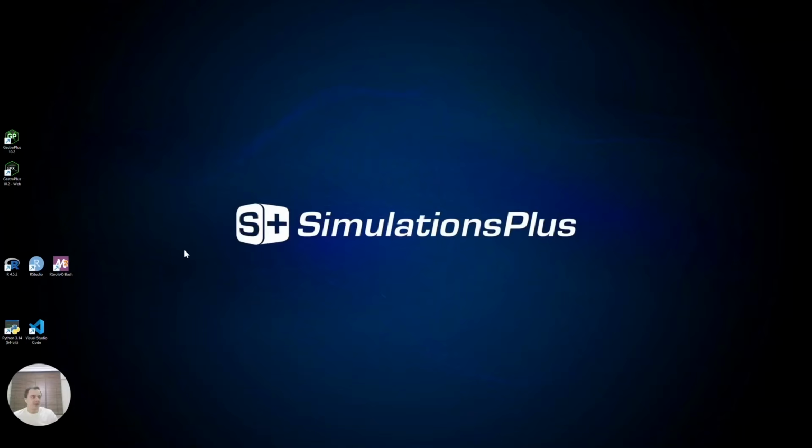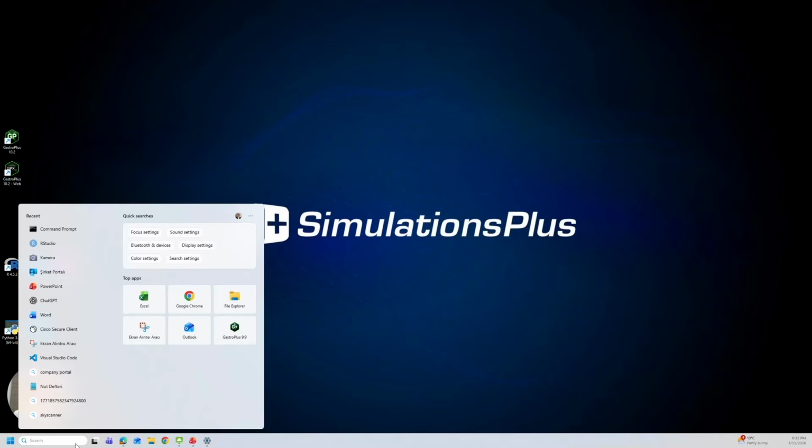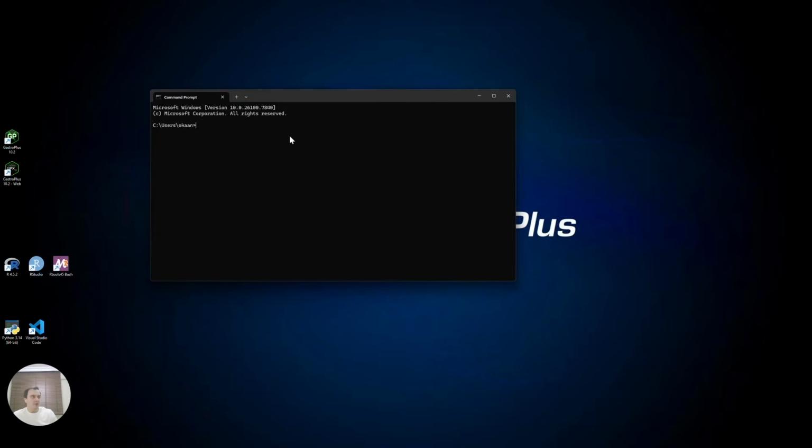Alright, here I am back to my desktop. Here you can see that I have already installed the Python base version and the IDE, which is Visual Studio Code. So we will start with installing the GastroPlus API Python package. So I will go to the Windows search box and type cmd and hit enter. This will open up the command prompt of Windows.